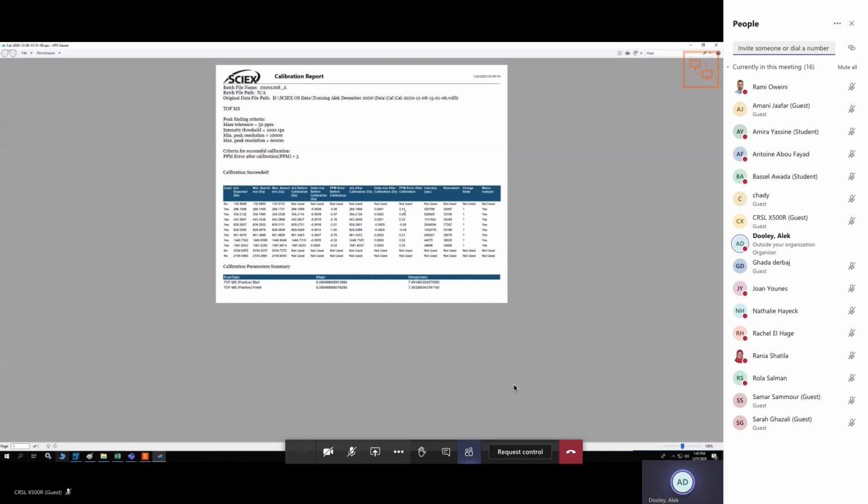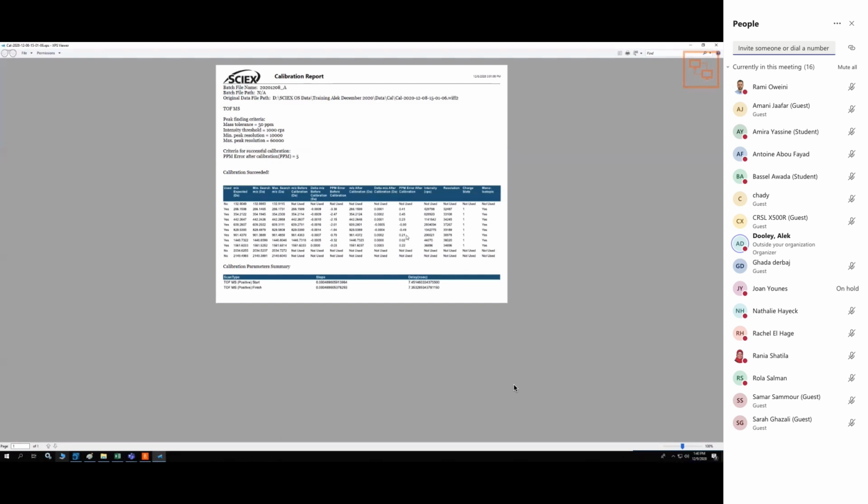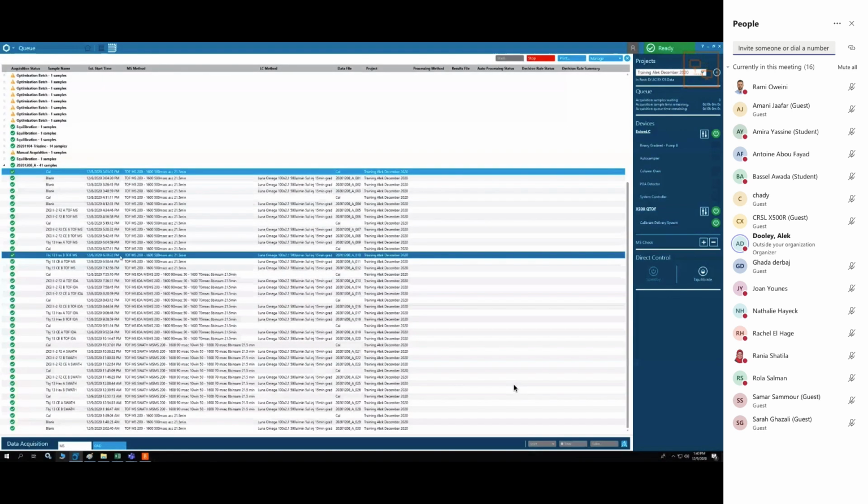So you see here everything is below 1 ppm, even below half a ppm. Oh no, there's one at 0.9. Right, so that's well within the spec of 2 ppm. So to get the report, again, you double click on the check mark. Sometimes we may ask you to send us the report from the calibration.